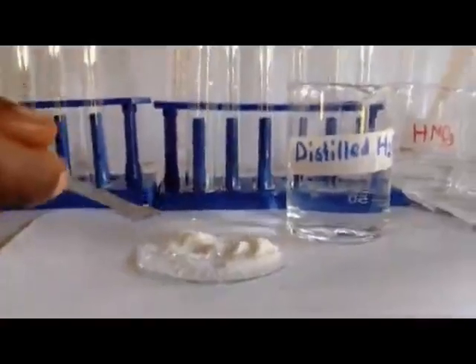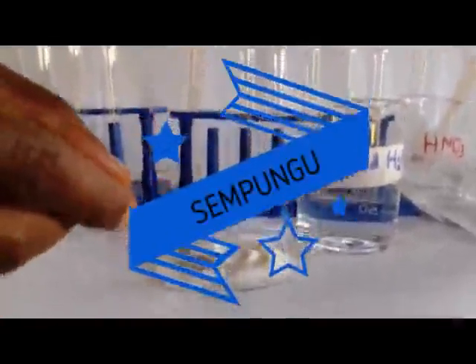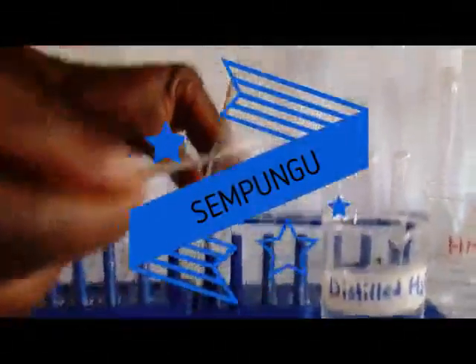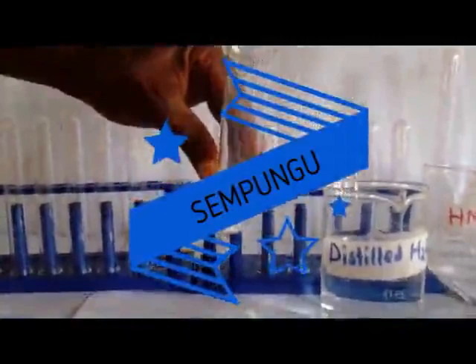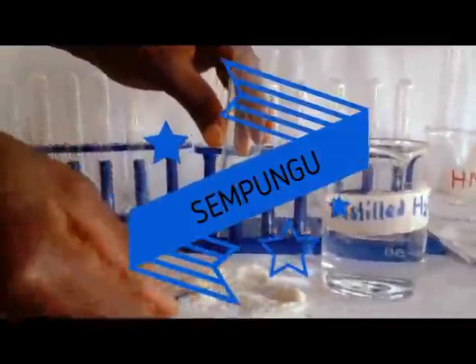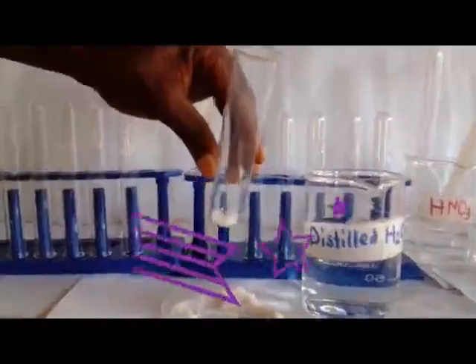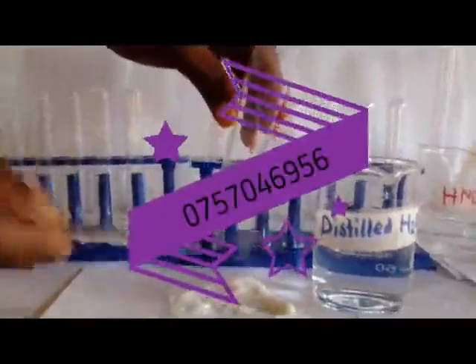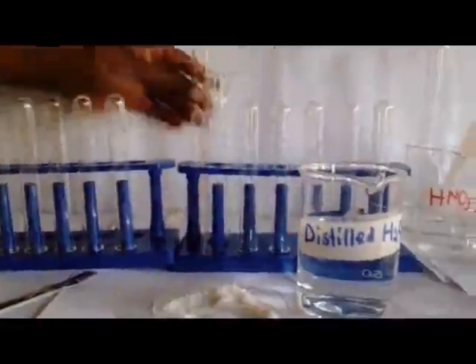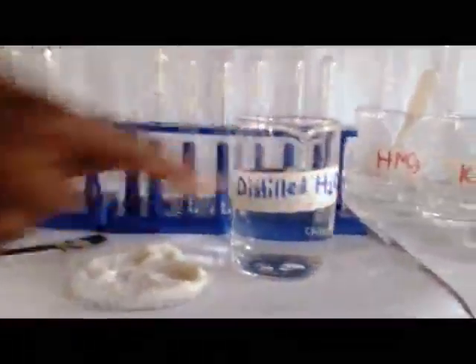Then liquid condensing at the cooler parts of the test tube, you will say water of crystallization, hence hydrated solid. Then three, because of the reddish brown turning yellow, reddish brown when hot and yellow when cold, we can finally say that lead oxide formed, hence lead ions are present. The same with the cracking sound and the same with the melting. That is evidence that nitrates are present.